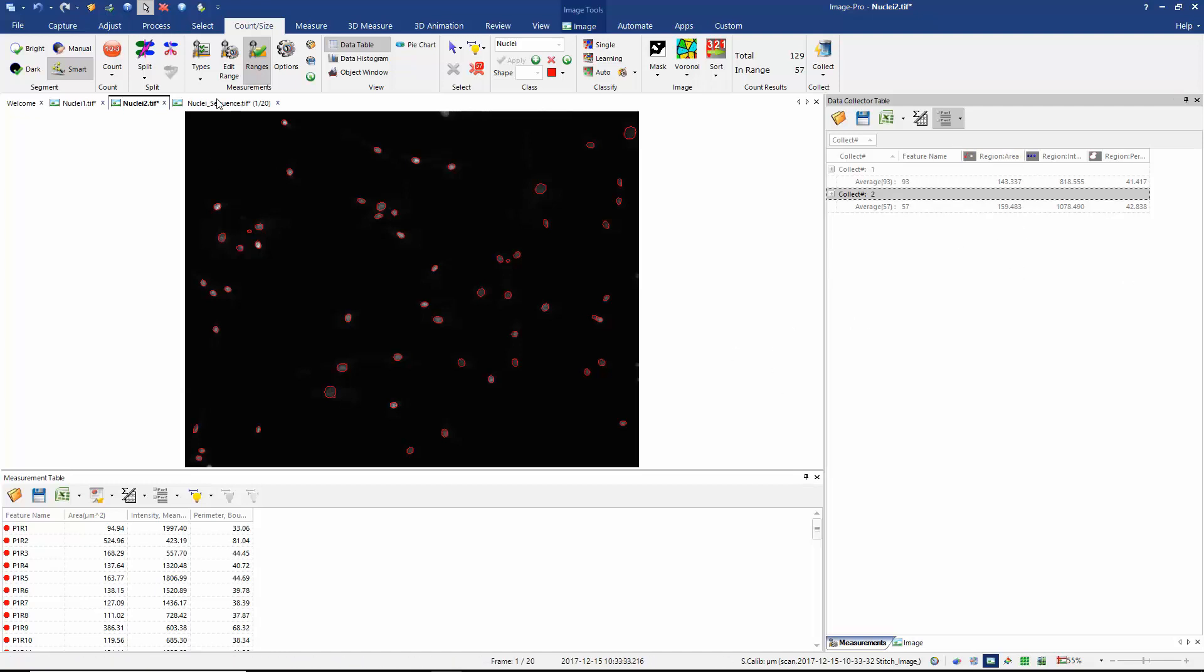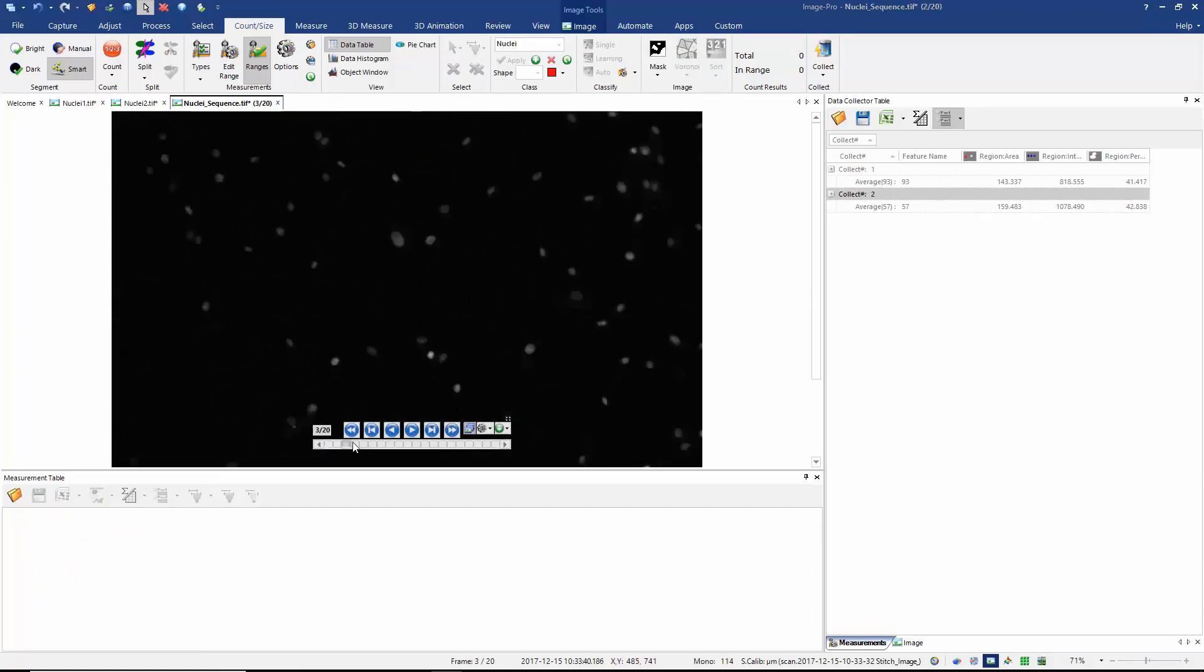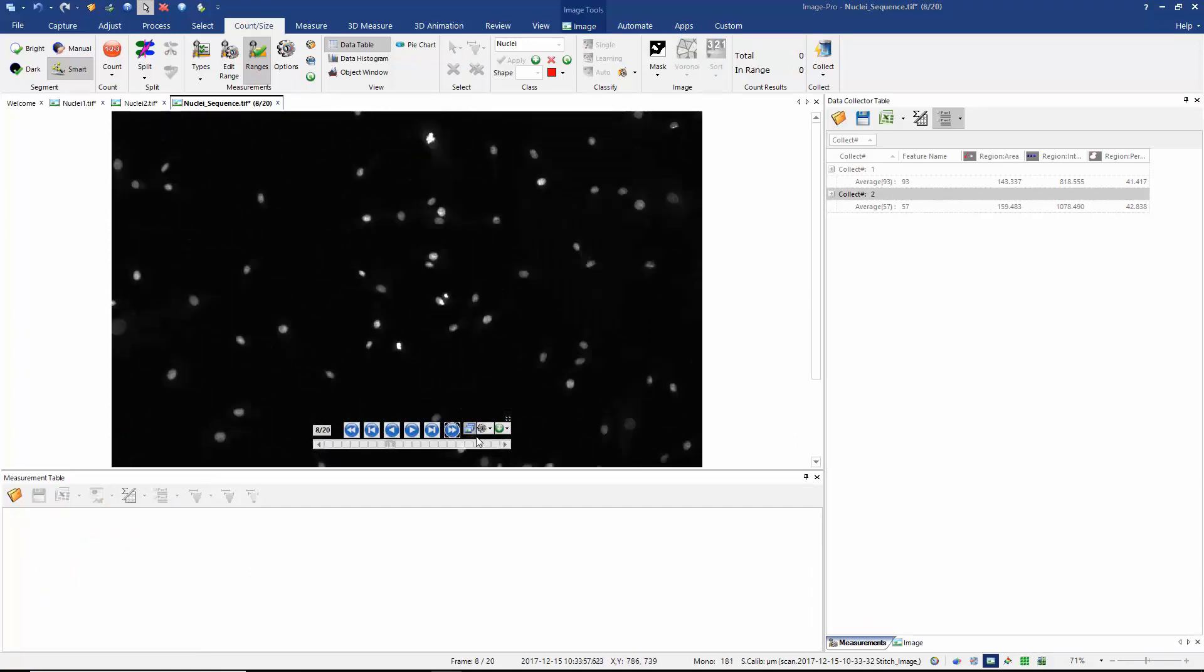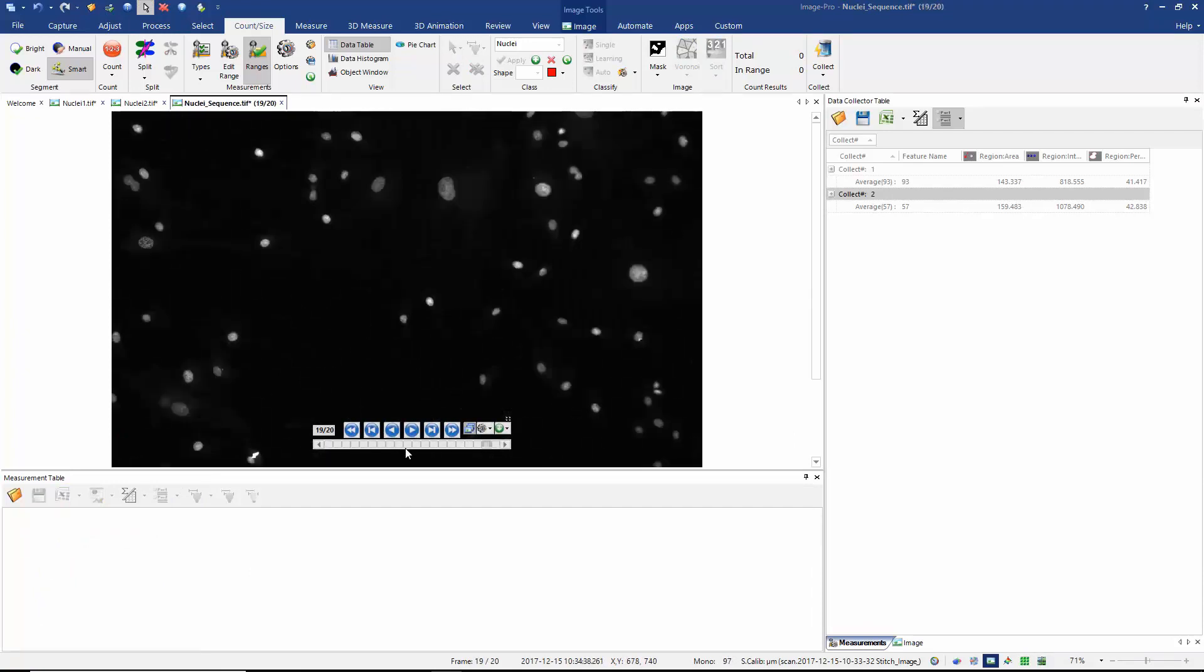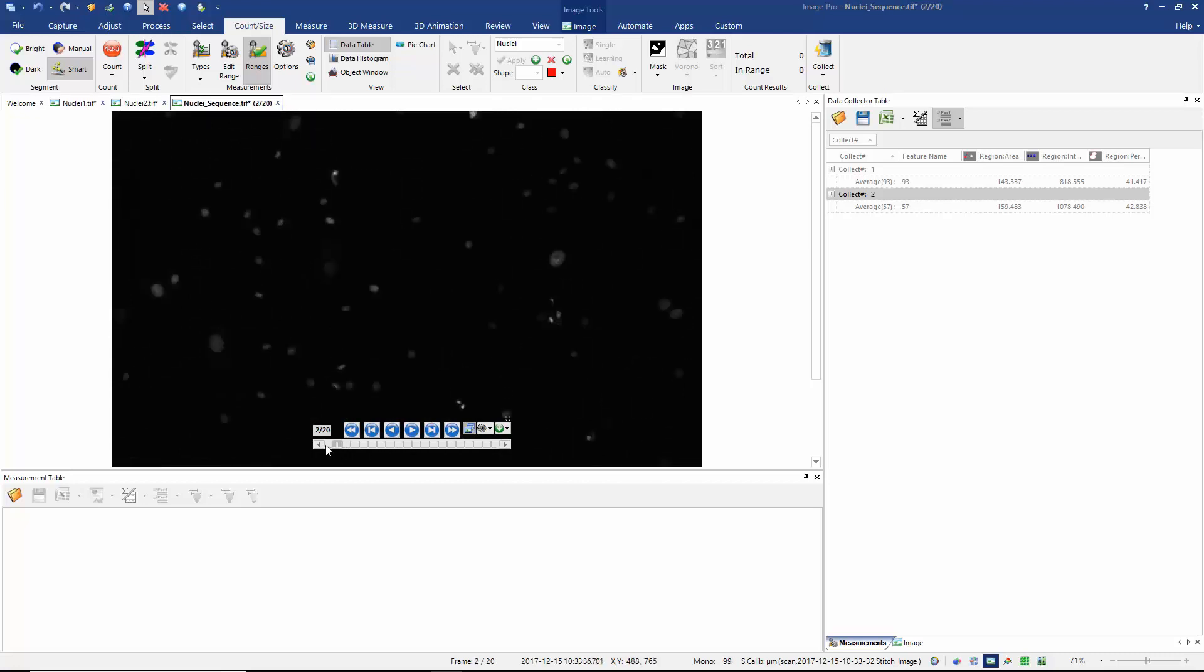Now we move on to my image sequence. What I want to do now in this image sequence which is composed of 20 frames is I want to count and measure the nuclei in all 20 of those frames. And there are various different ways I could achieve this.